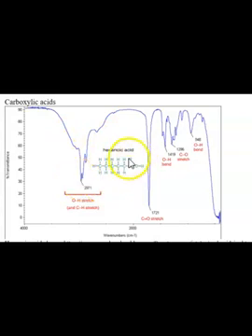Okay. But here's another example. That C double bond O is right here. That's the carbonyl group, not 1760 here, it's 1721. But look how nice this is, that it tells you also that you have the OH here, that you have a CO bond, and then another OH bond. Now, these are pretty specific, but they're helpful.